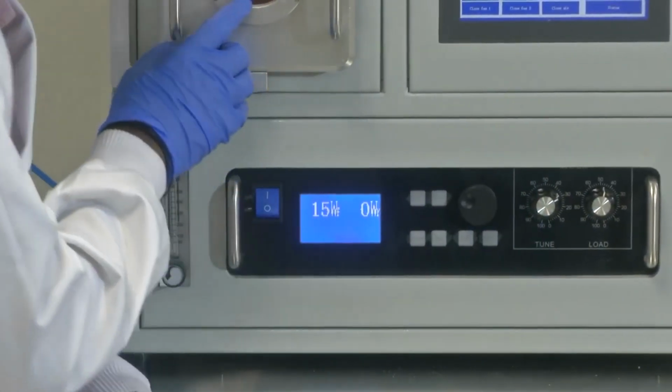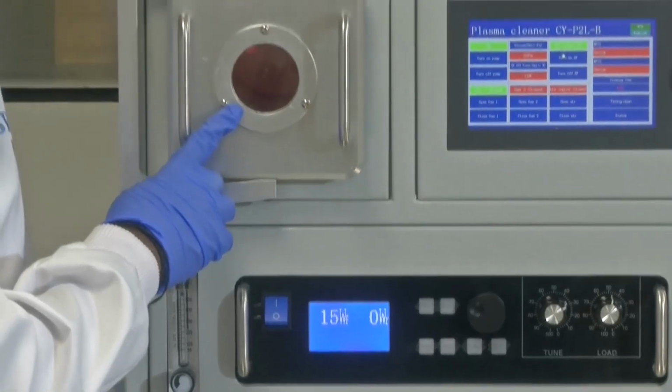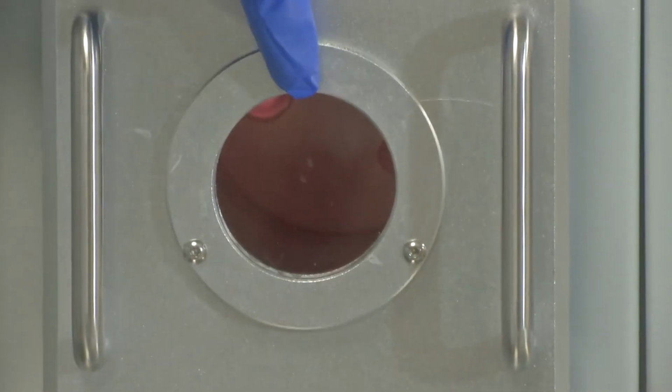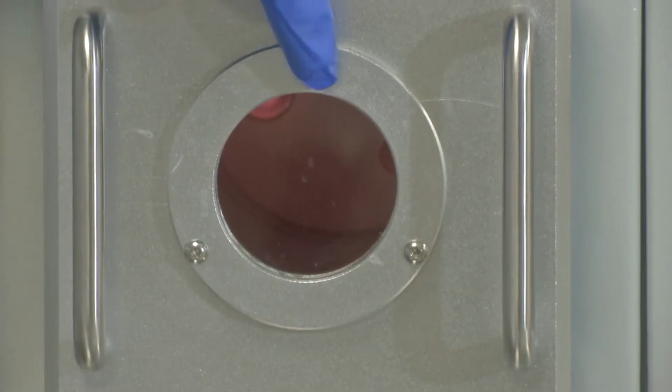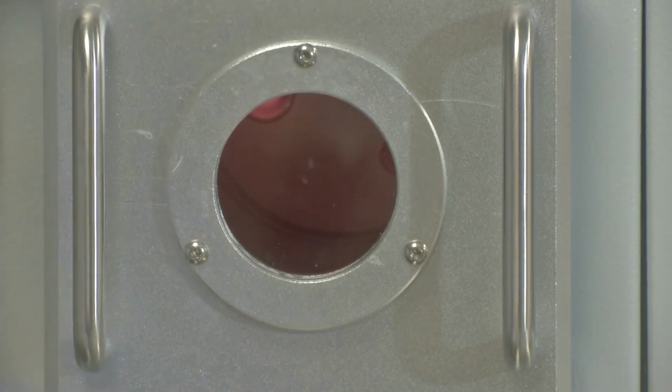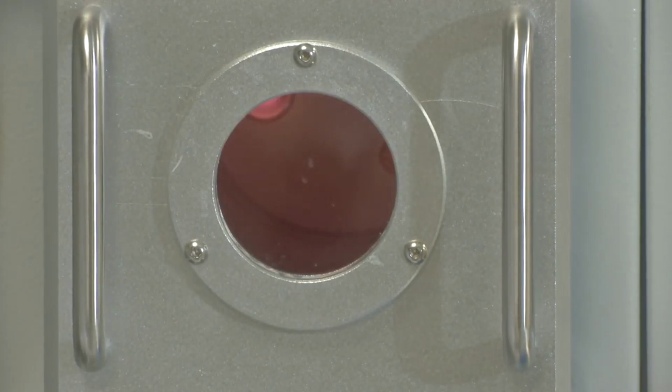Now you can see a light pink color coming in the chamber. That is at 15 watt RF power. Let me increase the power. 16, 18. You can see that the intensity of the plasma is increasing. So I will increase and keep it at 50 watt RF power.